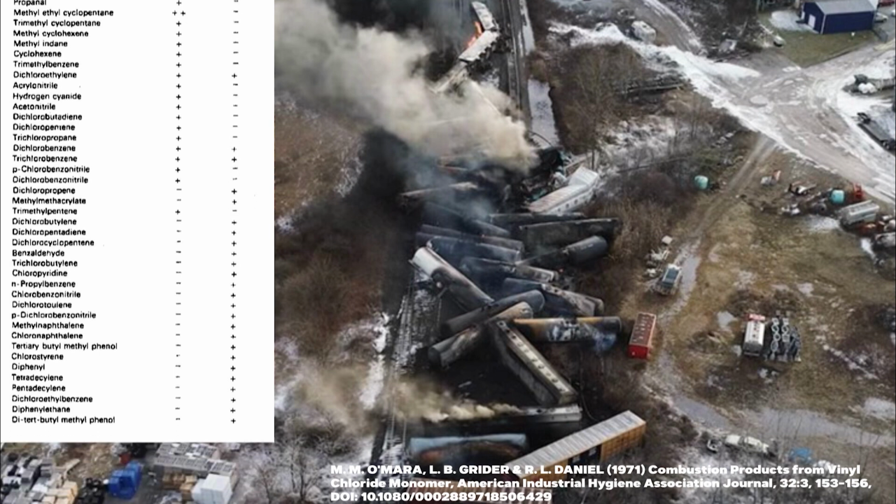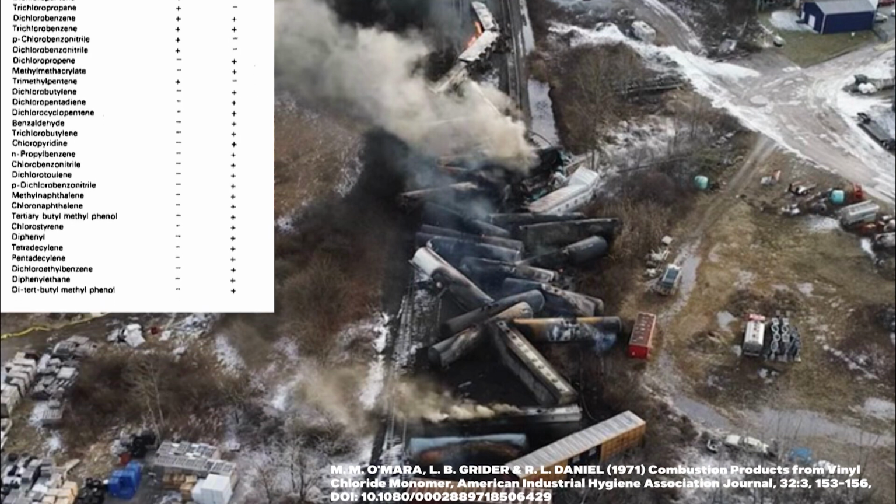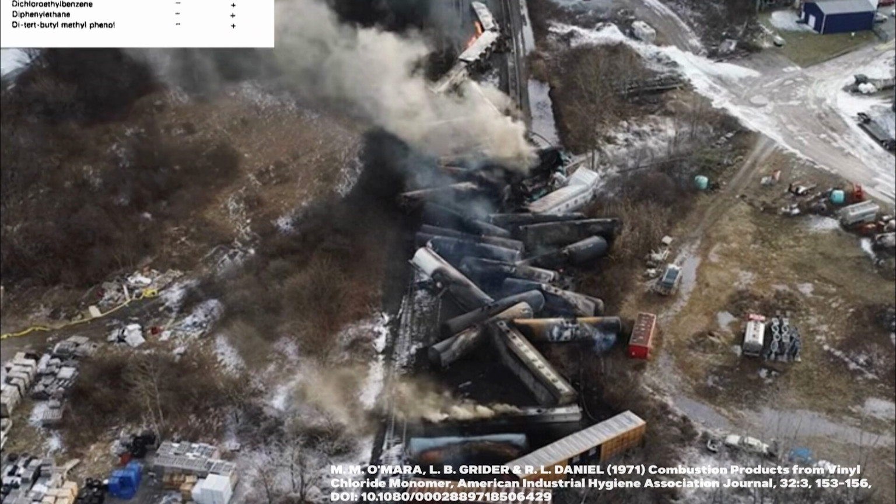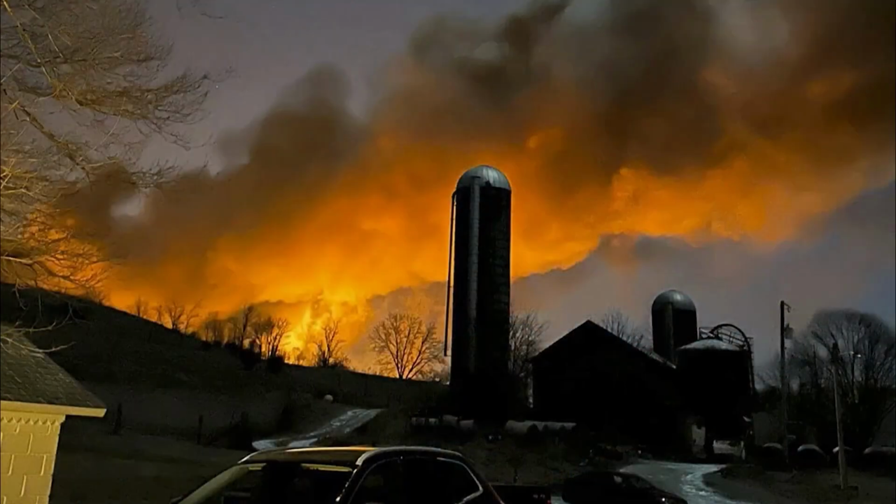And while benzene is the only one of these precursor chemicals that can be easily analyzed by HPLC, a large majority of the products produced from a high-temperature environment such as this can be detected, analyzed, and quantified. This positions HPLC as a prime analytical technique for assisting in the cleanup.